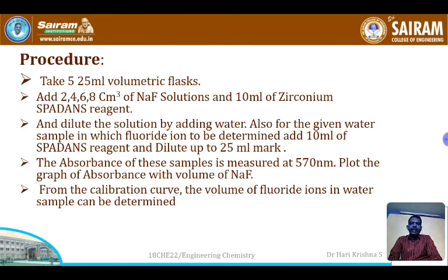8, we are going to add 8 ml of sodium fluoride solution. And for the test solution, the unknown solution, a sample of water is filled in that. For each flask from 2 to the test solution, we are going to add 10 ml of Zirconium SPADNS reagent. Thus, the remaining volumetric flask, the 25 ml volumetric flask, we are going to fill it with the water sample, by adding distilled water.